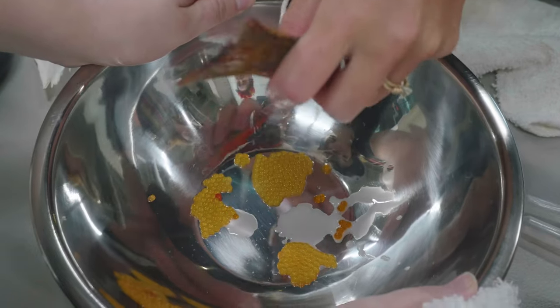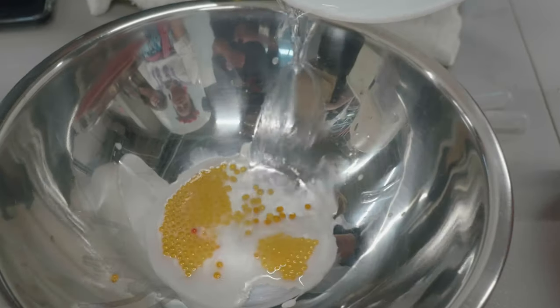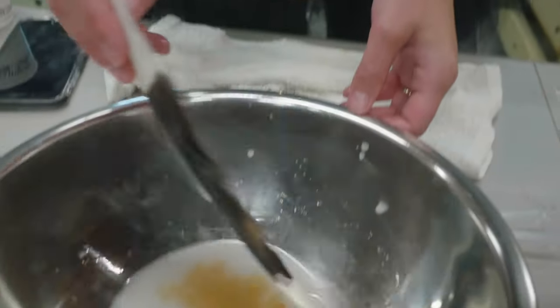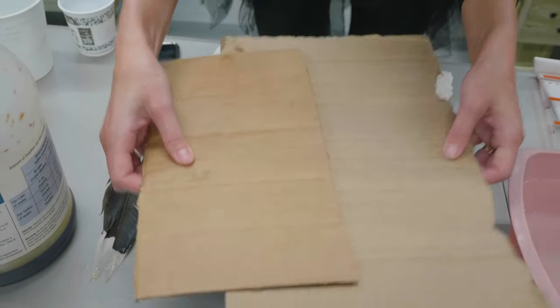Once we have eggs from a female, then we will get some males and we will do the same process with them, spawning them over the eggs in the bowl. Then we actually mix them together with a little bit of saline solution and a turkey feather. That turkey feather has very gentle bristles so it doesn't damage the eggs like a spoon might.